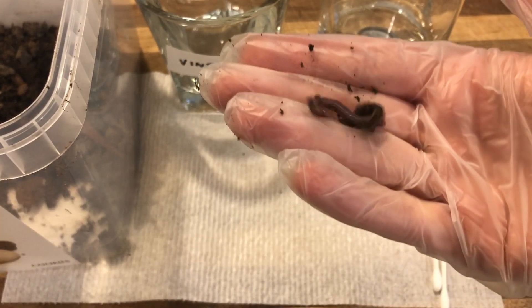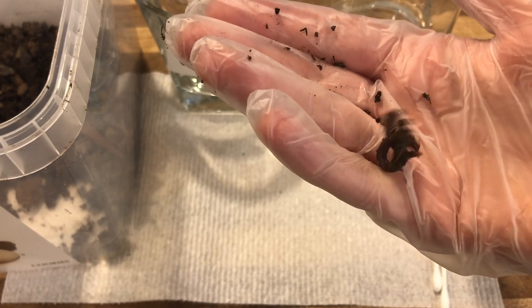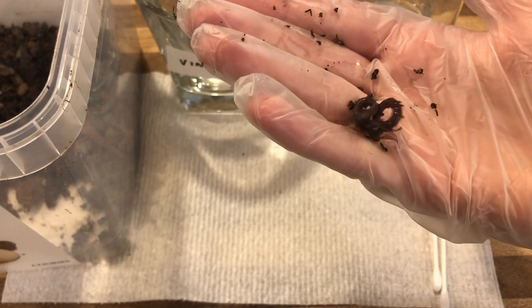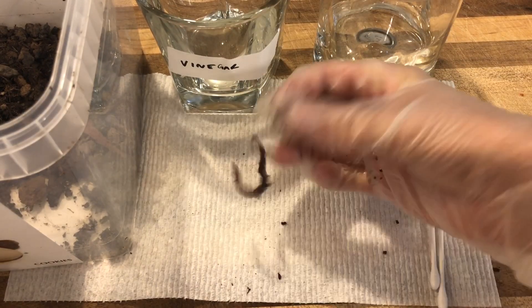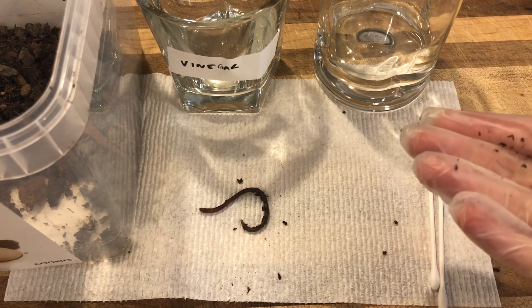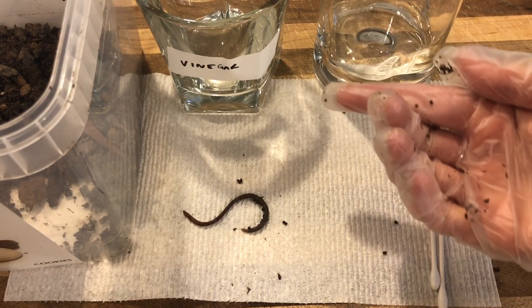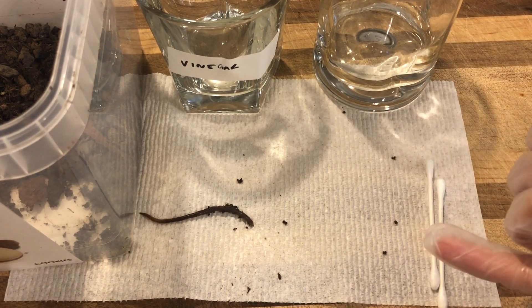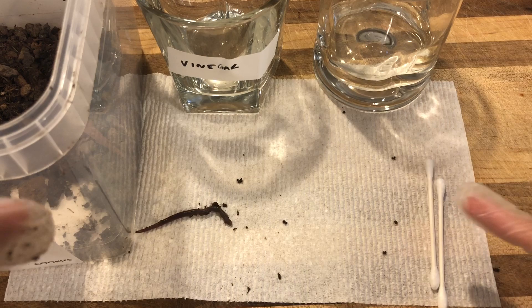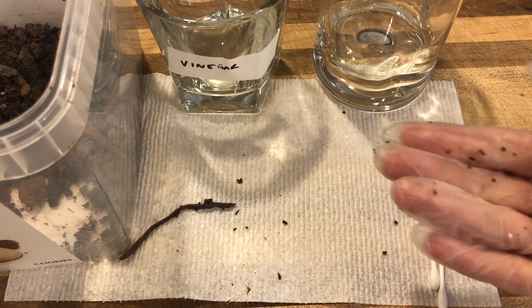You can see this guy is wiggling around. If you want to do your lab using the earthworm in this video you can, or you can go find your own in your own backyard. What you'll need for this lab is obviously an earthworm or this video. You're going to need some vinegar, or you can just watch the vinegar reactions in this video. Some water, some Q-tips, and a paper towel or somewhere to put your worm. You probably want to wear either gloves or just use your hands and make sure you wash your hands after the lab.